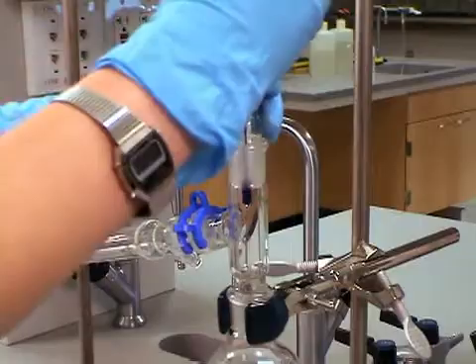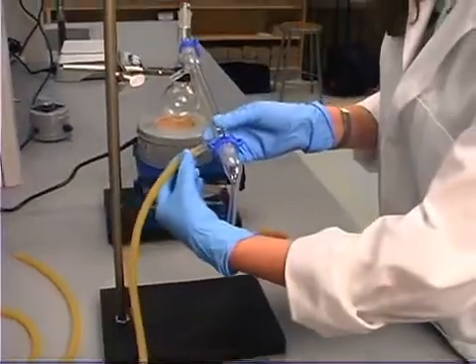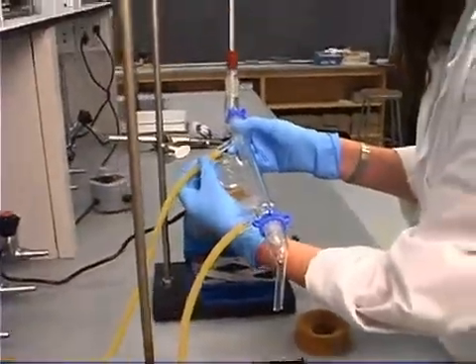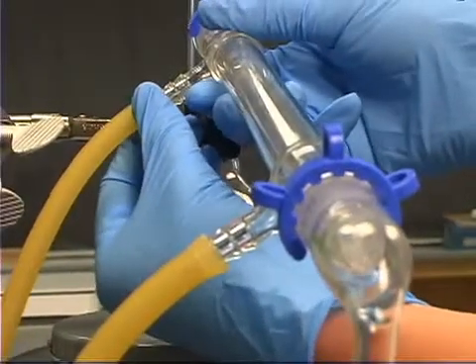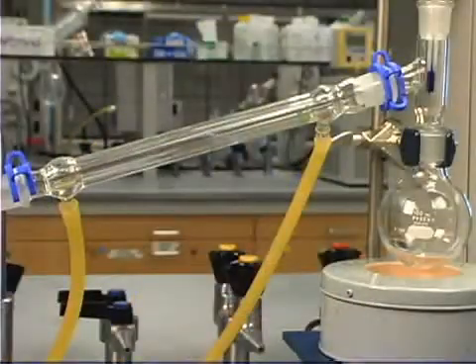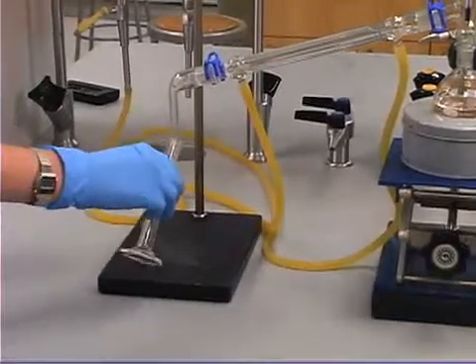Carefully adjust the level of the thermometer so it is just below the condenser outlet. Now connect rubber tubing from the faucet to the lower outlet and from the upper outlet to the drain. Begin a gentle flow of water and place a receiving container to collect the distillate.